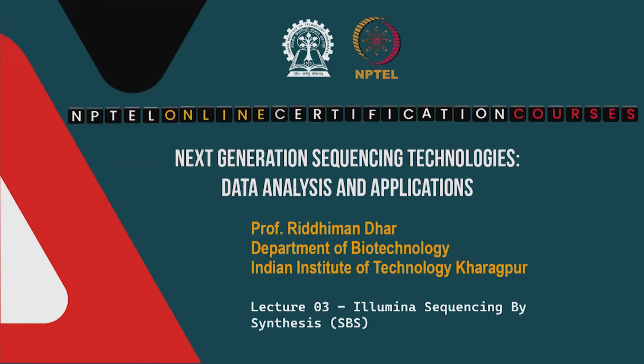Good day everyone, welcome to the course on next generation sequencing technologies, data analysis and applications. In the last class we started our discussion on the first next generation sequencing technology, which was Roche 454. In this class we will continue our discussion on other next generation sequencing technologies that are available today, especially focusing on the Illumina sequencing by synthesis method.